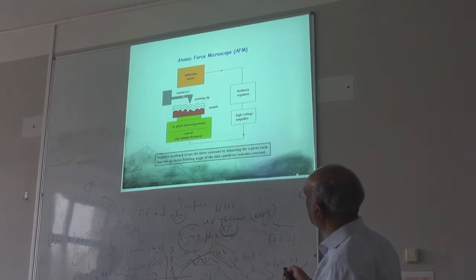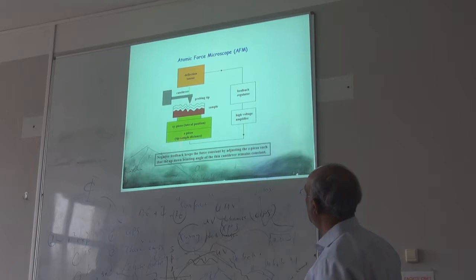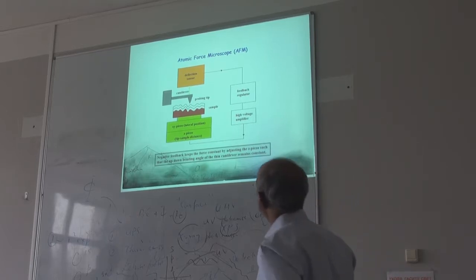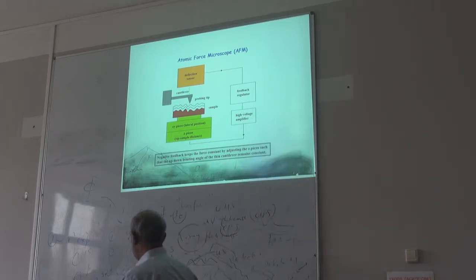To do that, you have to reflect some laser light here. From that reflectance you can have some detector. So only thing is you need to keep the force constant. That's the important thing. In the STM, you have to keep the current constant. In the AFM, you need to keep the force constant.